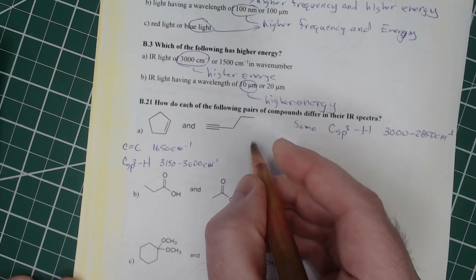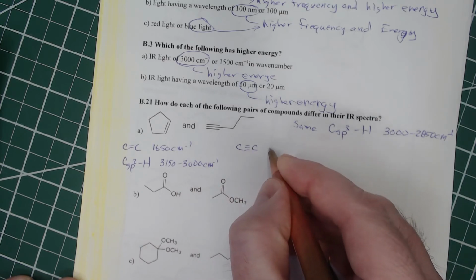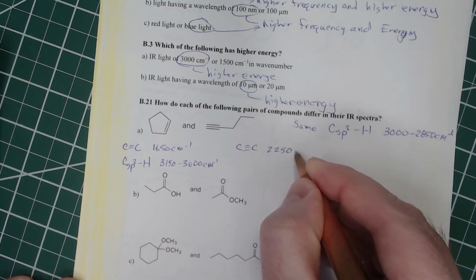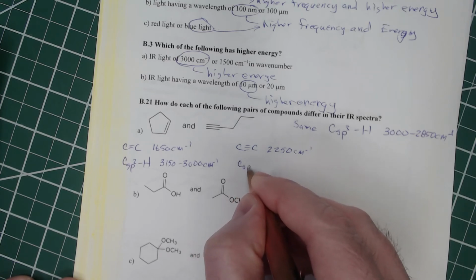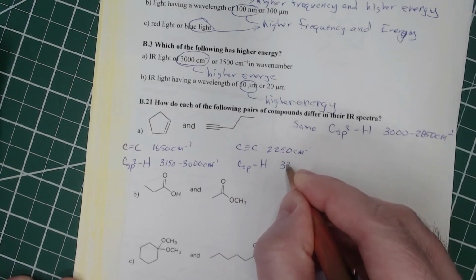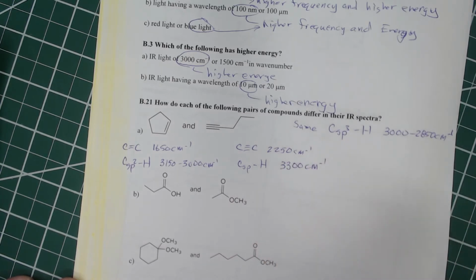This one will have a carbon-carbon triple bond, and it has a pretty unique absorption at about 2250 reciprocal centimeters. And we'll also have a carbon sp hydrogen, and that one is also very characteristic at approximately 3300 reciprocal centimeters.